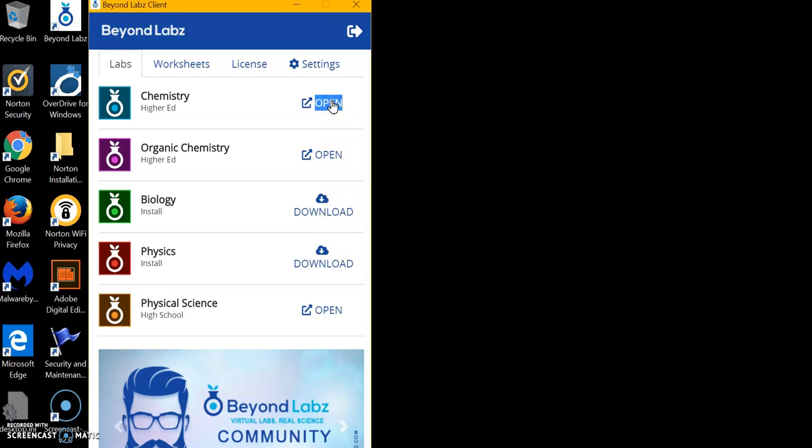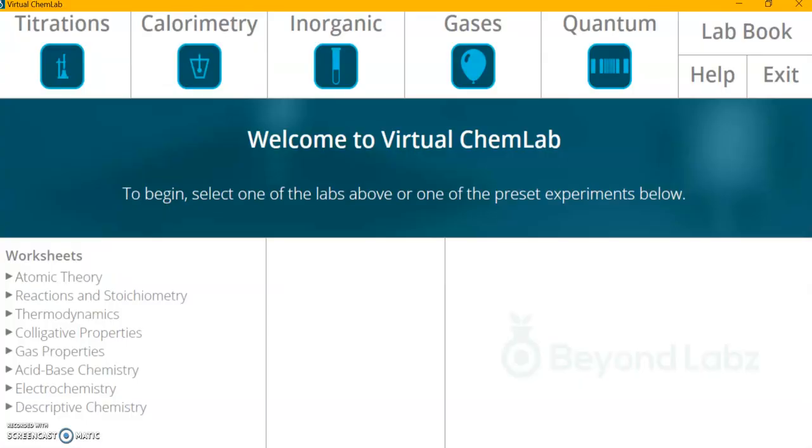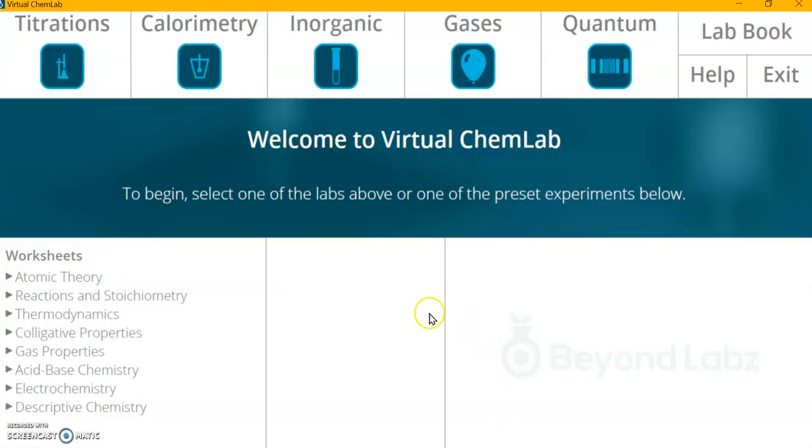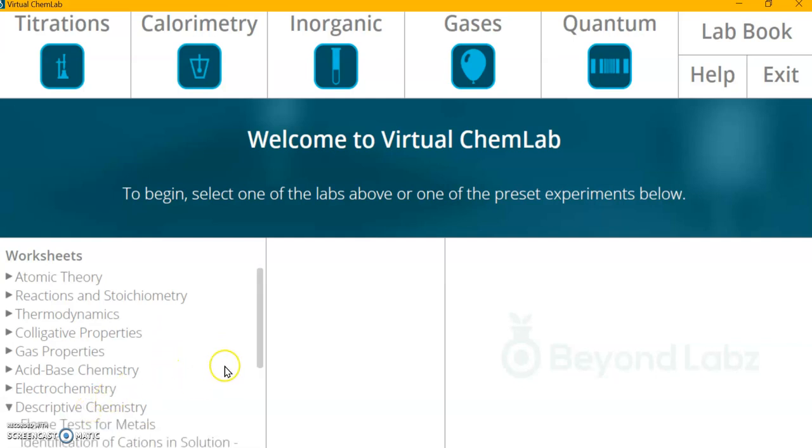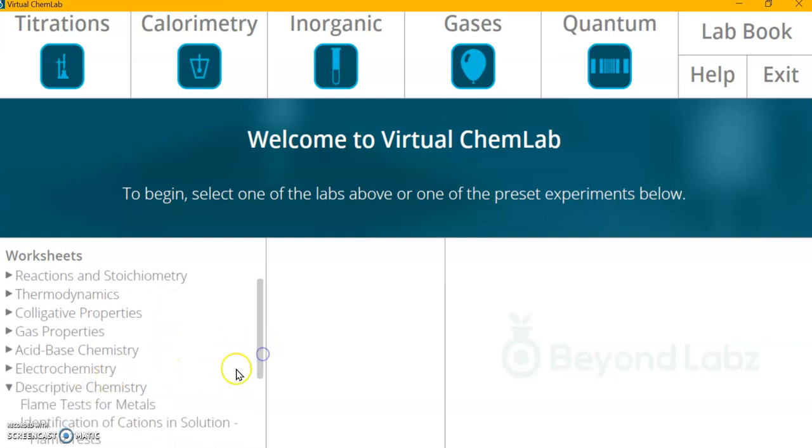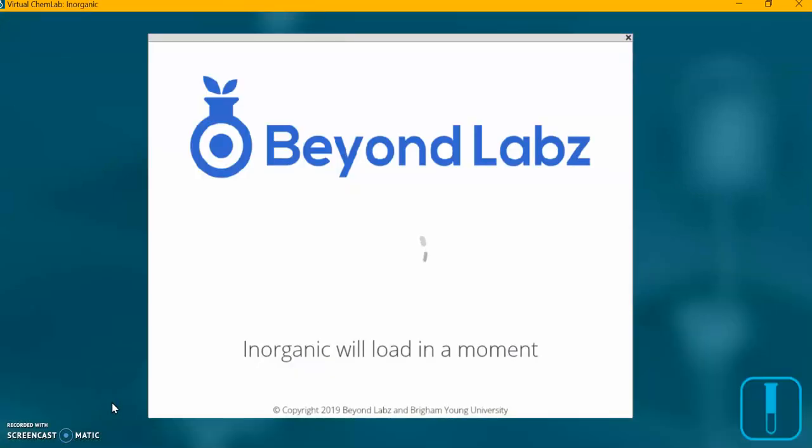I'm going to click my open button here for the virtual chem lab. Here we go. Let's see, Descriptive Chemistry, and we're going to click on Flame Test for Metals.